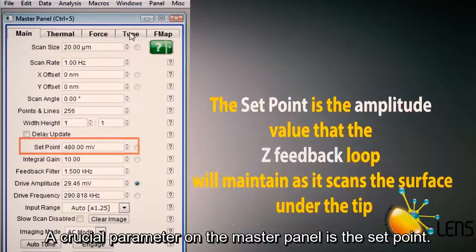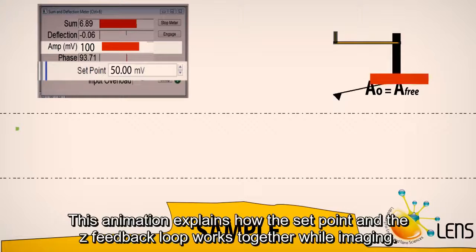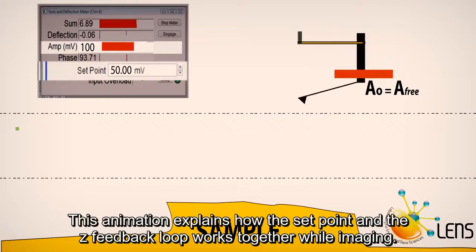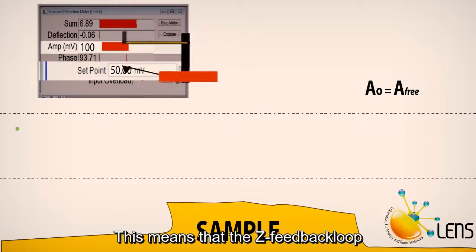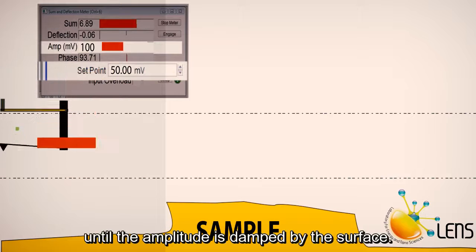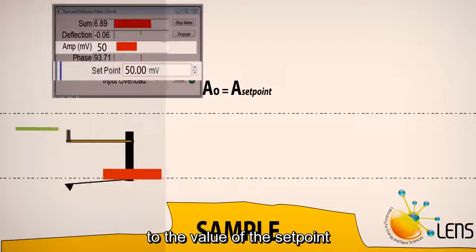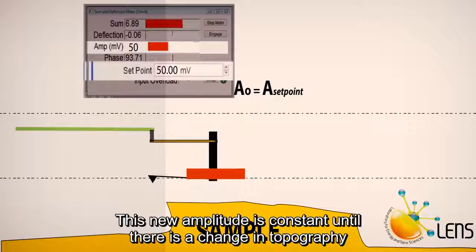A crucial parameter on the master panel is the set point. The set point is the amplitude value that the Z feedback loop will maintain as it scans the surface under the tip. This animation explains how the set point and the Z feedback loop work together while imaging. For a given set point, the Z feedback loop will move the piezo towards the surface until the amplitude is damped by the surface to the value of the set point. This new amplitude is constant until there is a change in topography.